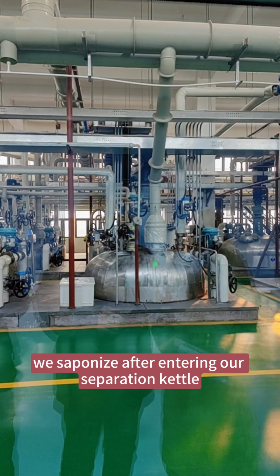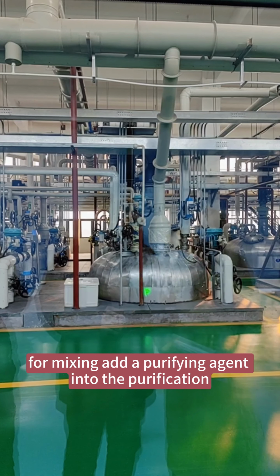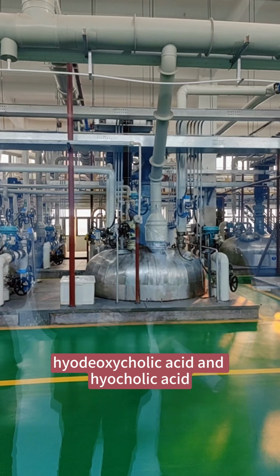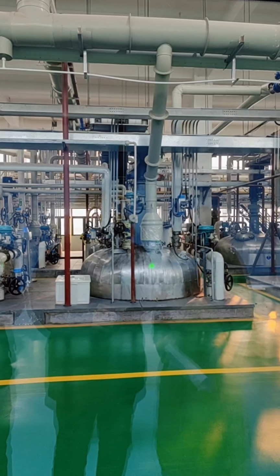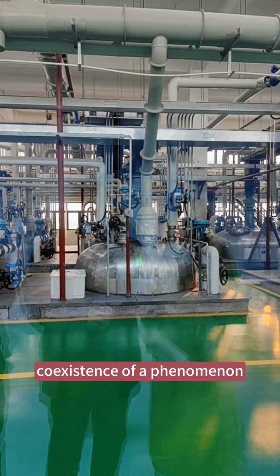After the saponified material enters our separation kettle, the first separation kettle will carry out the first step of sedimentation with mixing. We add a purifying agent to make the porcine deoxycholic acid and porcine cholic acid form a solid. At this time, this kettle shows a solid-liquid coexistence phenomenon.